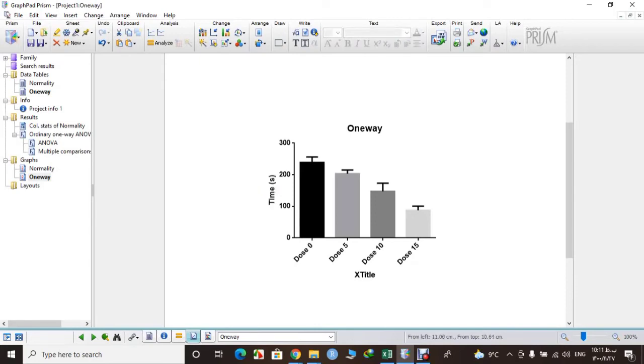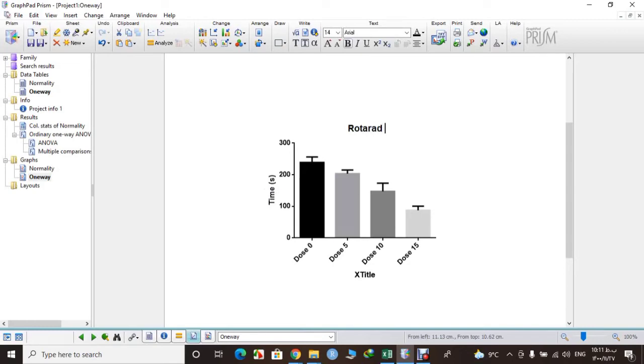You can change anything of this graph. For example, title, whatever you like. Just select it, click on it, and just write what you want. For example, we will write here Rotarod test.